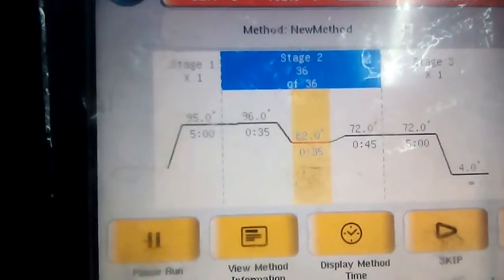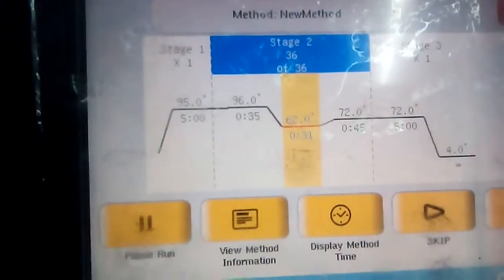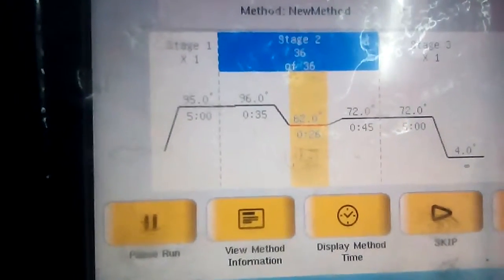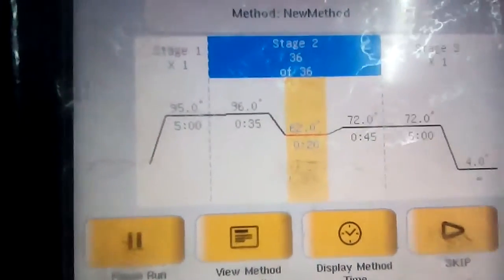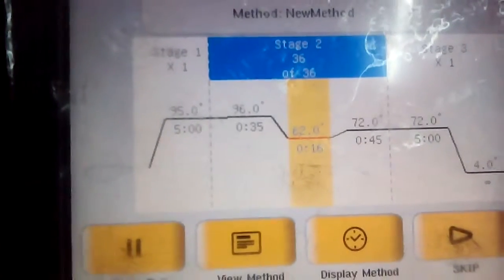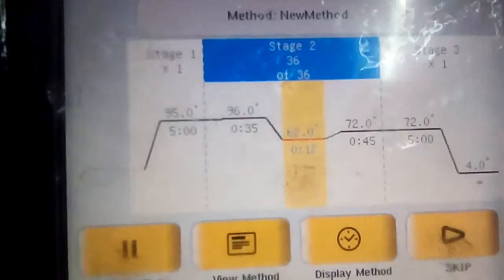The second is the annealing phase where the forward and reverse primers get annealed to their complementary sequence in the single stranded DNA. The temperature is maintained at 62 degrees Celsius for 35 seconds. The time is now decreasing.